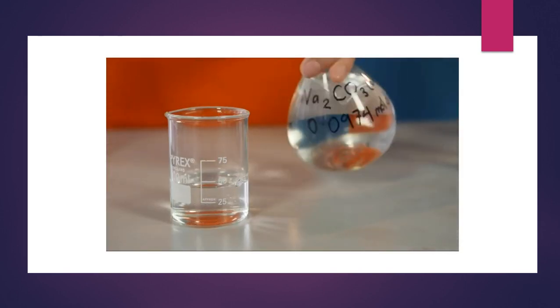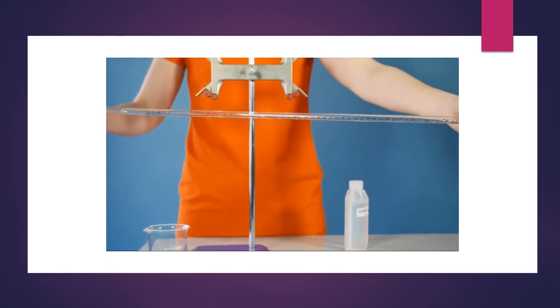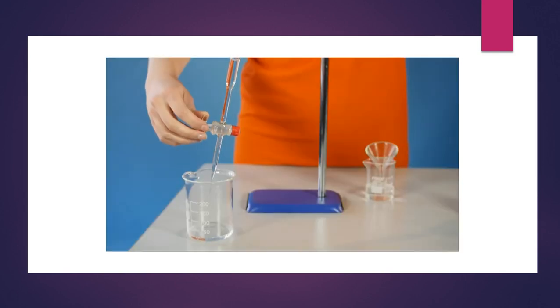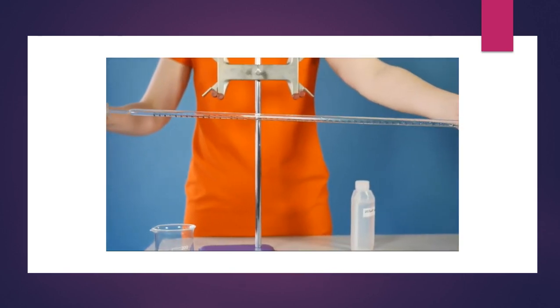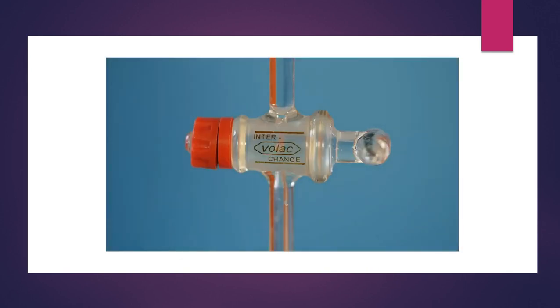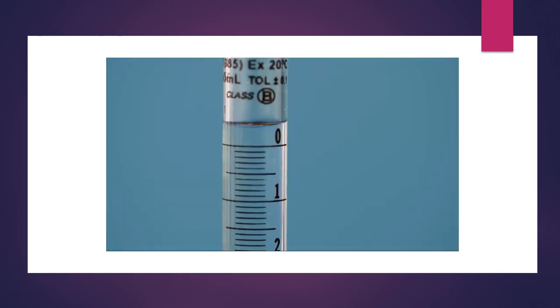Pour approximately 50 cm³ of your stock sodium carbonate solution into a dry clean beaker. Rinse the burette several times with distilled water. Using the funnel, add a little of the sodium carbonate solution to rinse through the burette above and below the tap. Discard the rinsings and repeat two more times — this makes sure that you do not dilute the solution when you fill the burette. Fill the burette with sodium carbonate solution above the zero mark and remove the funnel. Allow the solution to flow until the level is at or just below the zero mark, and ensure there are no air bubbles in the nozzle. These can be removed by running a little more solution through the tap.